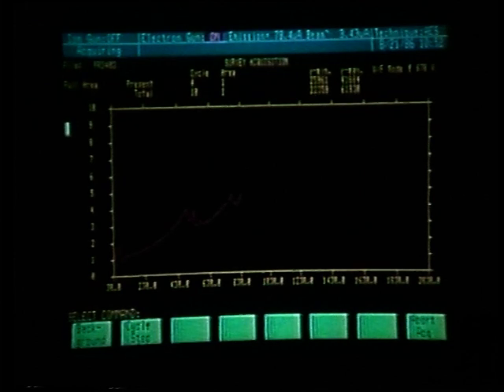If we found new elements, we could not add them to the profile, nor can we delete any elements from the profile. Once we have the windows set up for a profile, we cannot change them. So we will return to the profile with the windows that we have already set up. Again, we cannot add any or delete any. We are now on cycle number 5, so by pressing soft key number 2, we can stop at the end of this cycle.